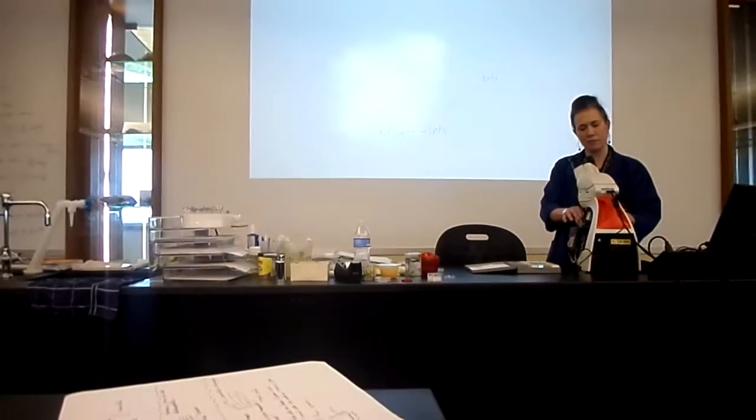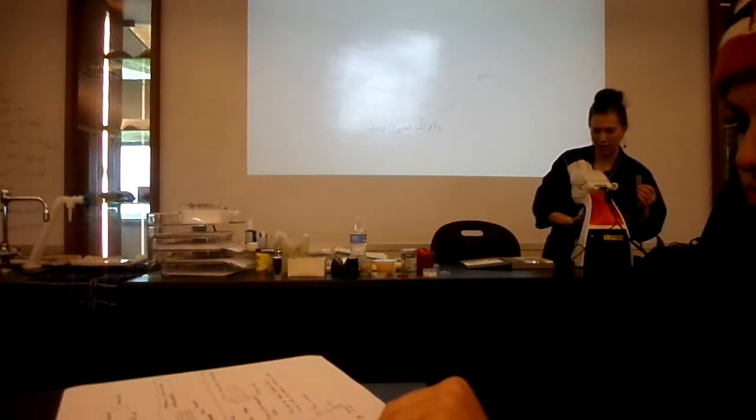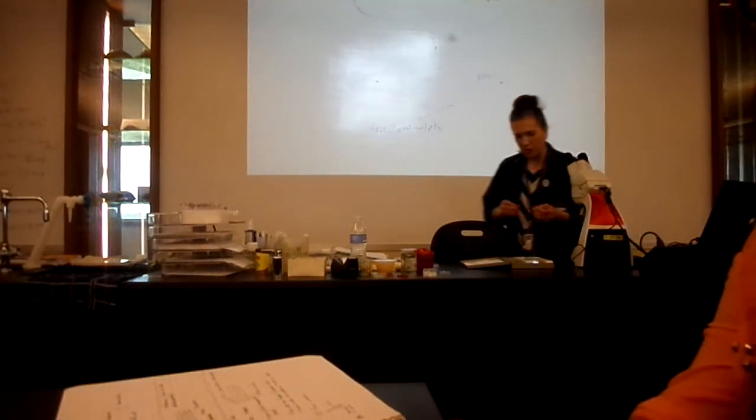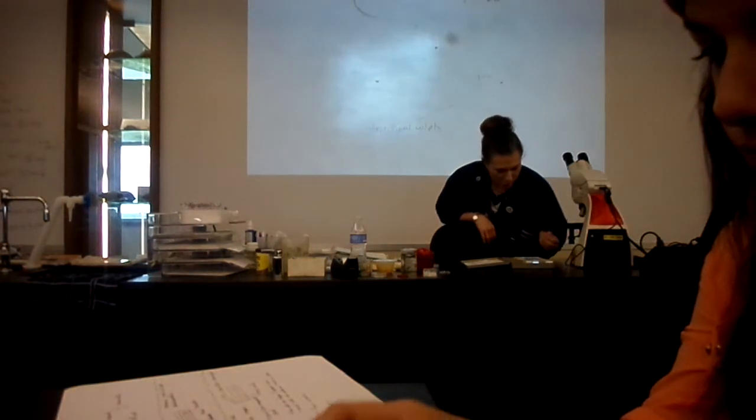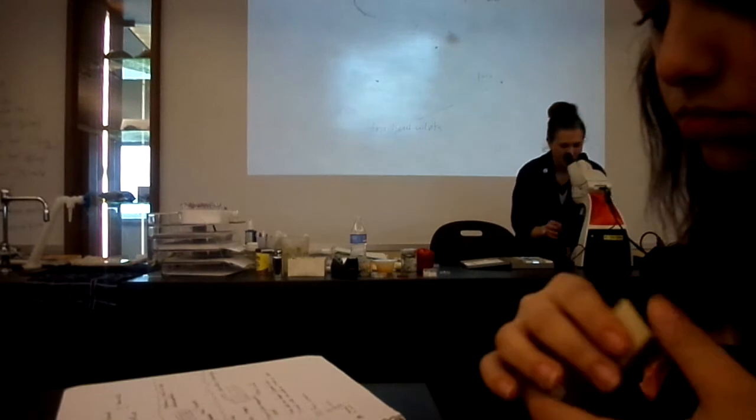All right, so look, the last slide, he's not on your list, but he is also the very last slide in your slide box. He is called cucurbita. He's pumpkin, basically. That's what pumpkin is. He's cucurbita. So look.